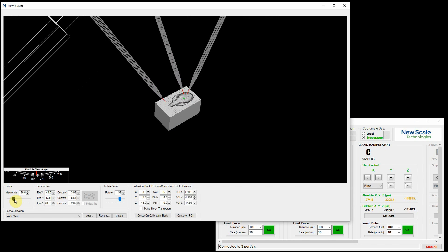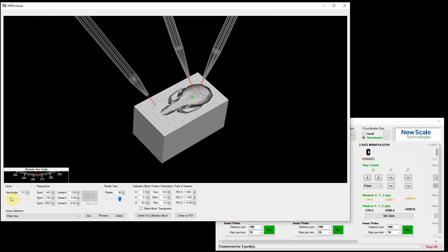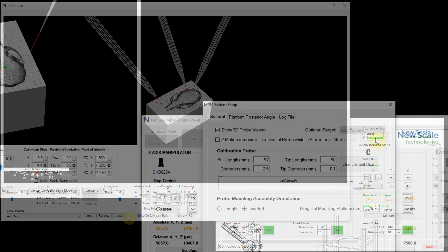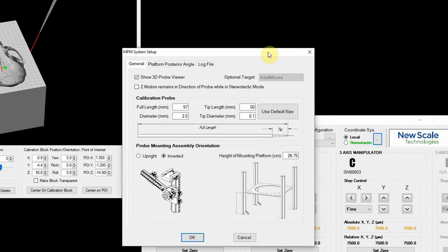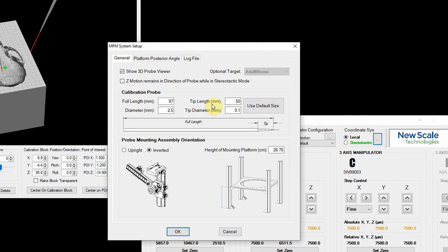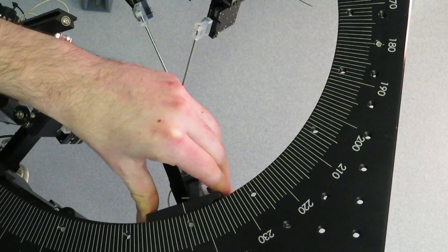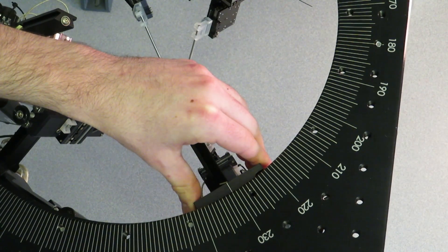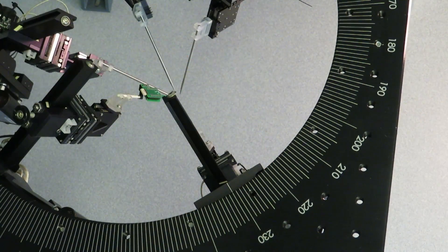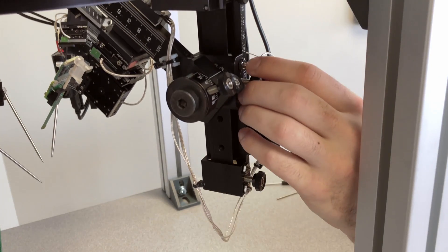Through these simulation exercises, you can determine in advance how you will set up your hardware. You can safely test your settings and explore different configurations. You can determine a workable height for the MPM platform and the exact positioning of each MPM arm, including polar angle, pitch angle, arm height, and arm length. When you're ready to proceed to the next step, you will be able to immediately set up your hardware correctly for the purpose of this experiment.